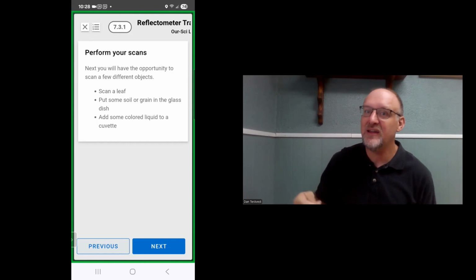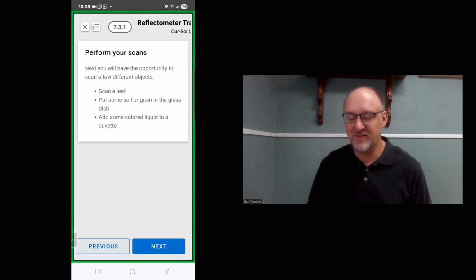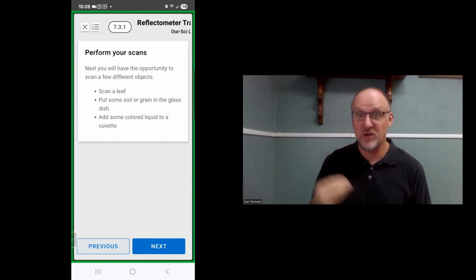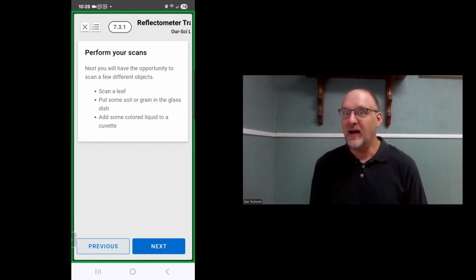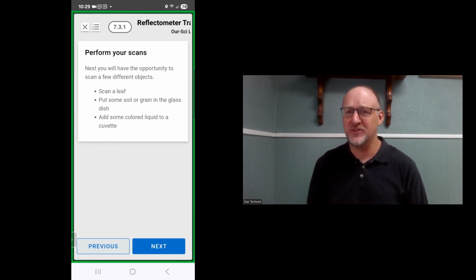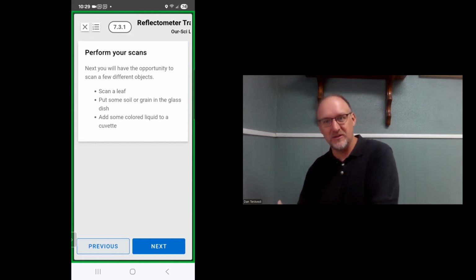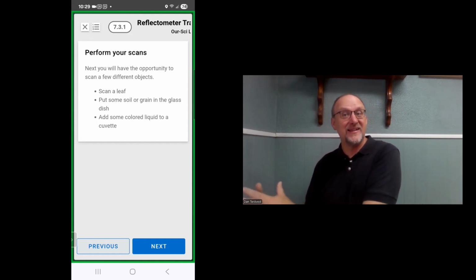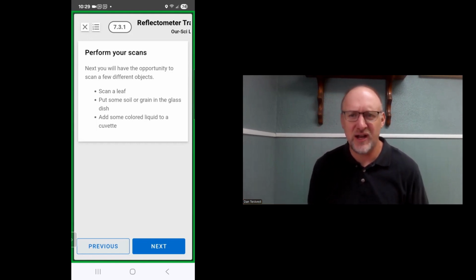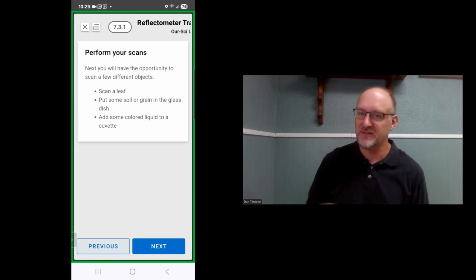Now, if you're in the field or you're planning to be in the field and you want to get soil scans and generate predictions, that soil moisture is still really important. If you're lucky enough to be in one of the parts of the world that has a distinct dry season, and by lucky, I mean that it's really easy to time when you go out to the field to ensure that the soil is dry, that's great. Time your sampling at periods where you know the soil will be dry, and then you can collect soil, sieve it, and scan it very quickly.